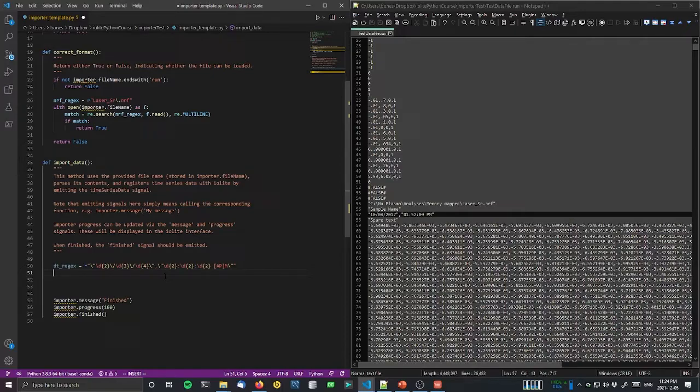Now we need to read in our data and see if we can find a match for that. So the way I do that is, to start off with, I'm just going to read in our data and store it as a variable. So let's put a comment saying that's what we're doing as well. Comments are always good. So read in file data.